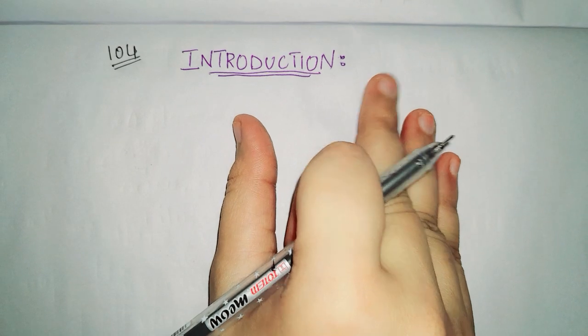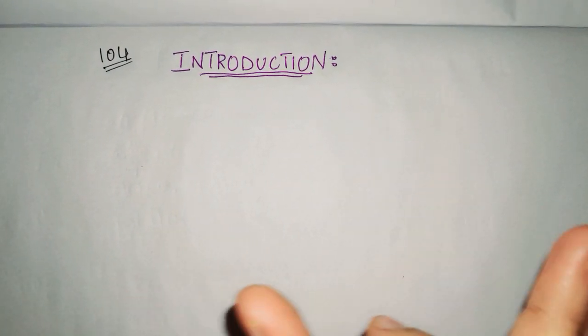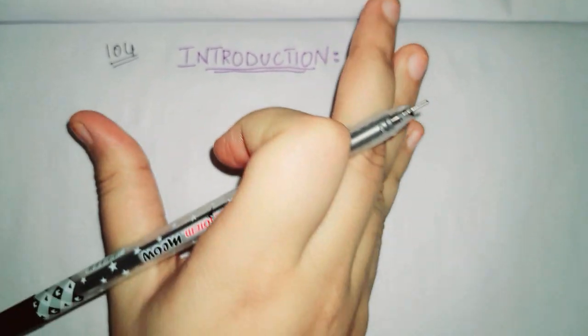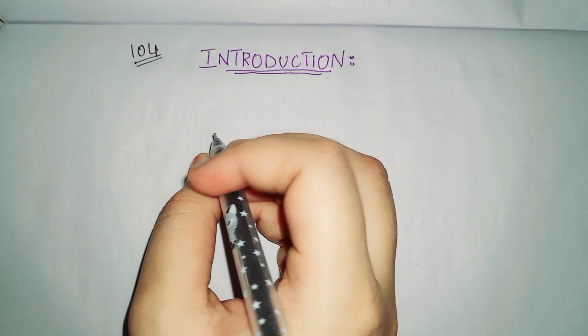Here I am going to give you the introduction of the first unit, the confusing terms. First we'll start from the confusing terms of this unit, and then we'll see the introduction, what are the basic topics which are very useful in this paper, in this first unit. So let's start with the terms called calorimetry and colorimetry.